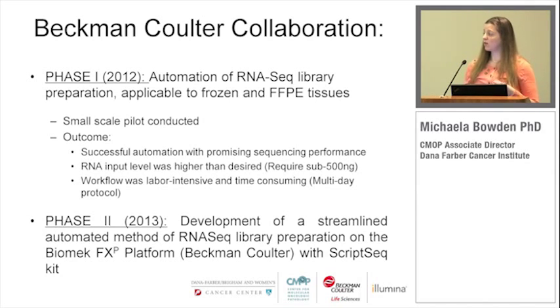And then we looked at doing it on a bench prep, and then how we would transfer that to automation and on the robot. And that worked out pretty well. Once we learned quite a lot from that, we wanted to figure out, okay, what are the more specific things we want to get at?